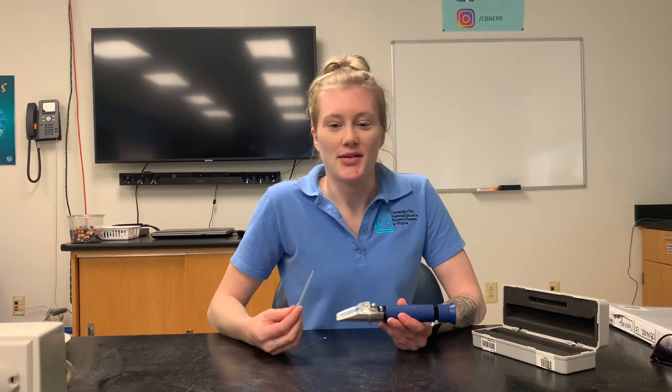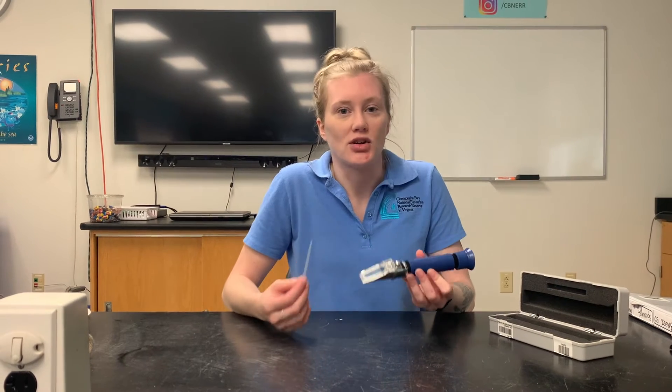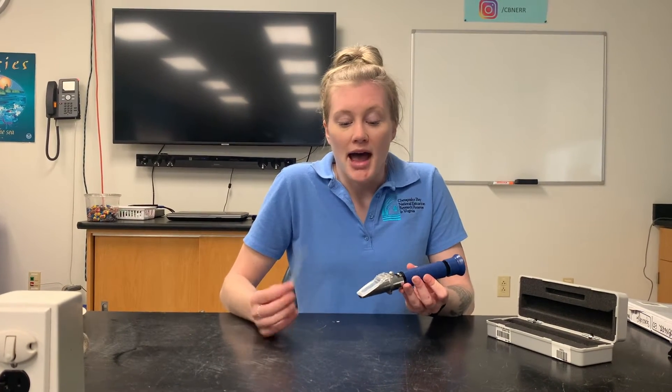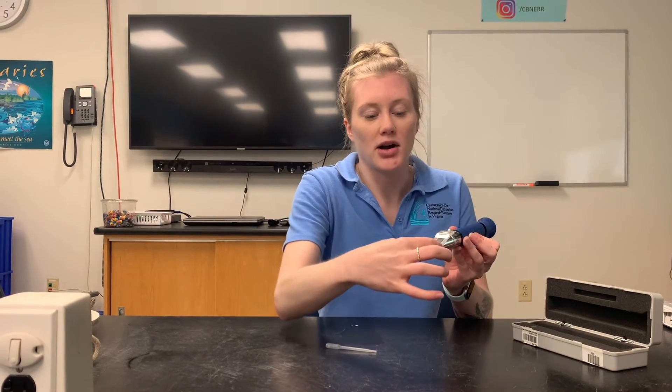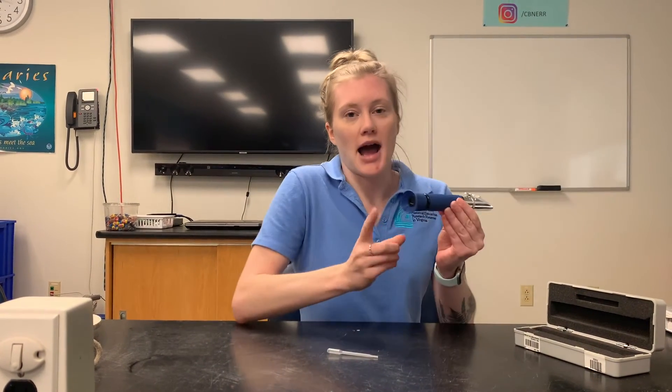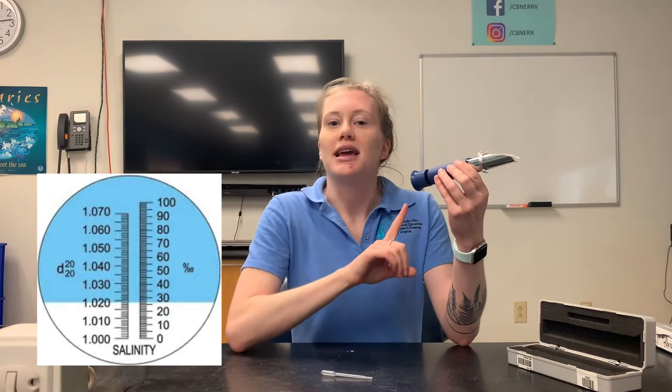The next piece of equipment is called a refractometer, and this helps us test salinity — how salty your water is. To use it, lift the little clear flap, make sure the sensor is clean, then take your water sample with a plastic pipette and drop one drop right on the sensor. Close the clear lid and look through the eyepiece, pointing it up toward the light — outside toward the sky, or toward an overhead light in the classroom. You'll see the parts per thousand reading for your water sample. We'll include a photo showing what it looks like through the eyepiece.